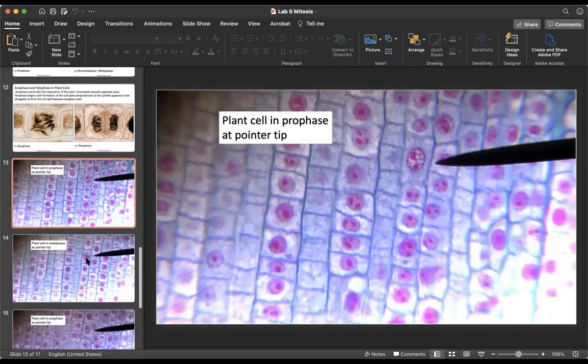And again, the questions that you saw in the lab manual, what sorts of tissues would you expect to see a lot of mitosis in, either a plant or an animal? Again, these examples are perfect. This plant came from a root tip. Root tips are actively growing, and the animal slides came from a whitefish embryo. Embryos are undergoing lots of mitosis. Those are two examples there.